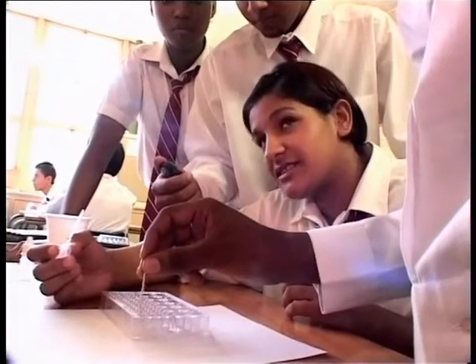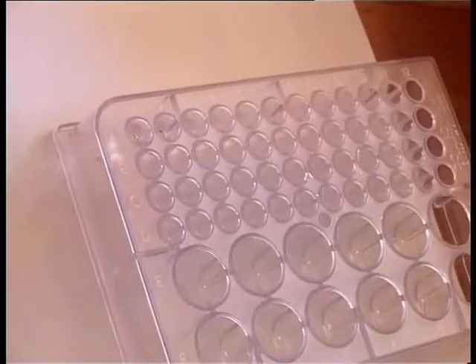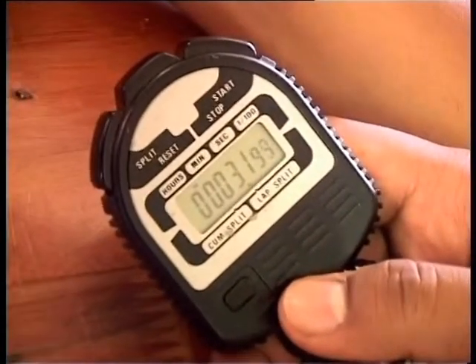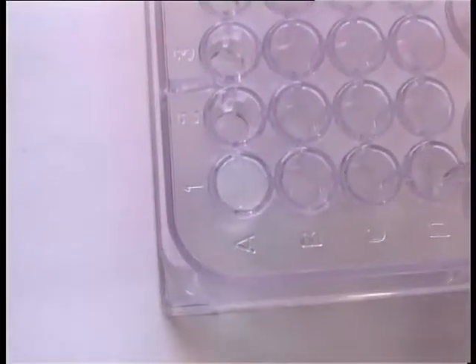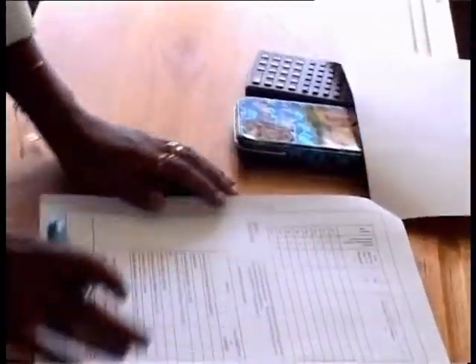Throw the toothpick away. Learners place the well of the combo plate in which the reaction is taking place above the cross. They will now observe the cross through the solution in the well and record the time it takes for the solution to turn a milky white and for the X to disappear. Okay. 9 minutes 43 seconds. A learner fills the time onto the worksheet and each group continues with the remainder of the experiment.